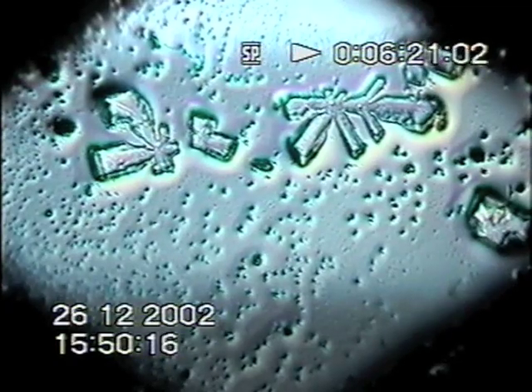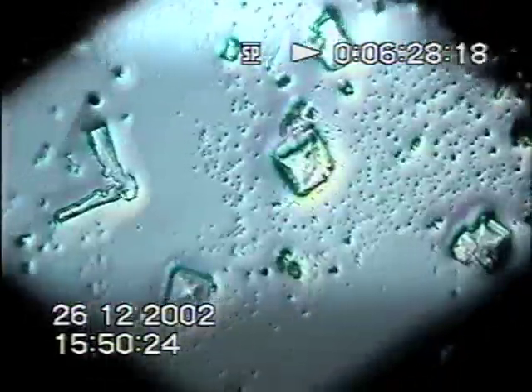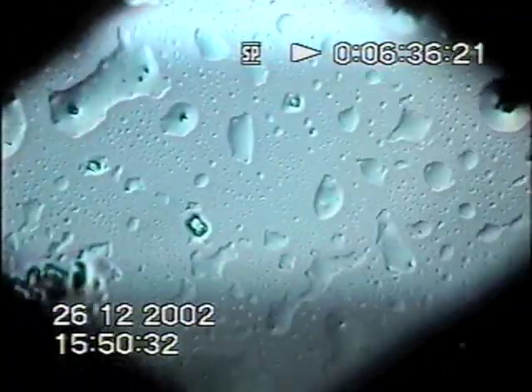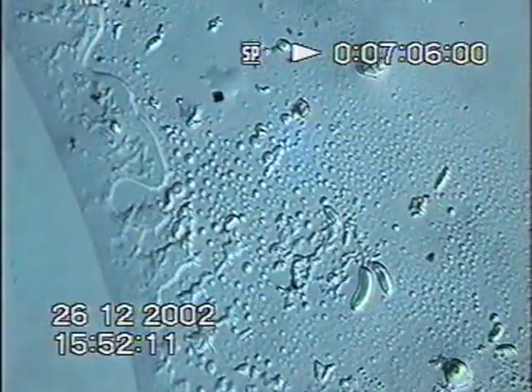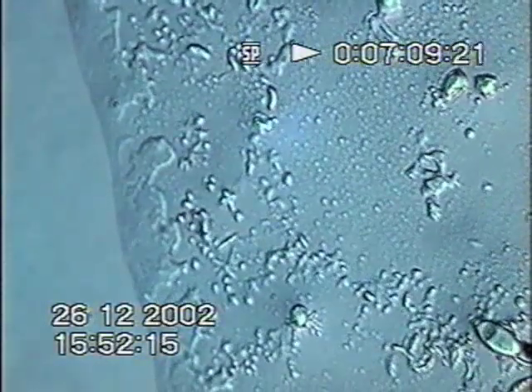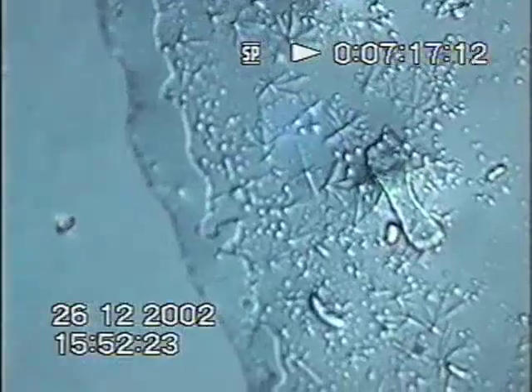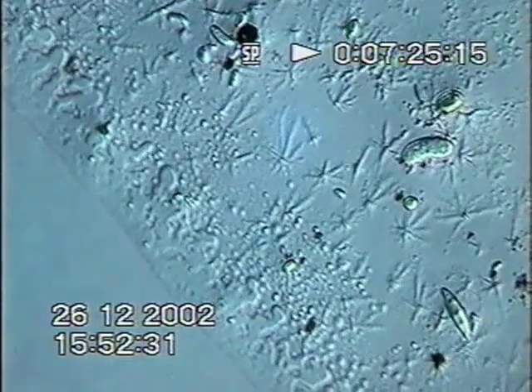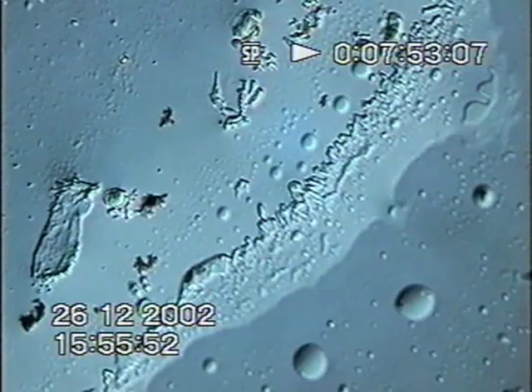Now, as it is drying out, we can see the crystals forming on the 10 lens. These are quite big. As the water is drying up, we can see the accumulation of spores, 20 lens, and formation of crystals, as you can see here. With the spore, a big fat sausage one, we'll put the 40 on here, see if we can have a better look at it. And now we're going to switch on the heat.